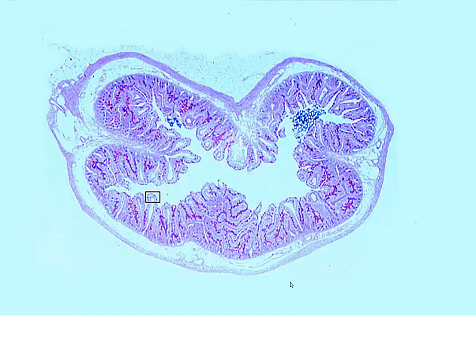Now, as we continue to look at alimentary canal, once again, we see the mucosa, submucosa, muscularis. We see the villi, so we know we're in small intestine. Some fairly prominent lacteals here, short villi, so we have a feeling we're not in duodenum, but we definitely don't see Brunner's glands. Now, we also don't see Peyer's patches, lymphoid nodules present, so we are still in jejunum.